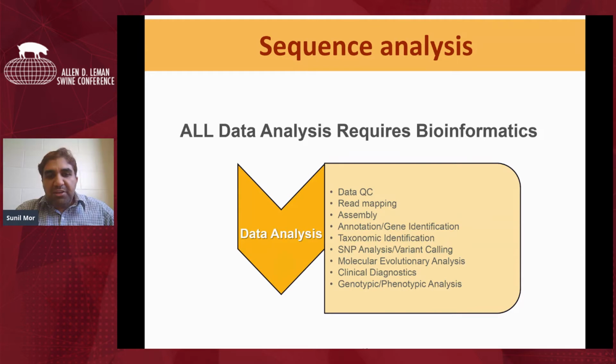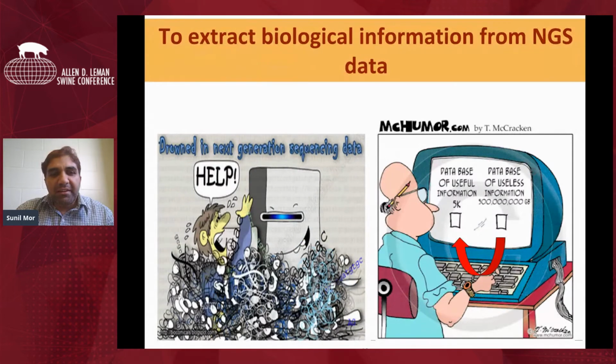Different steps are involved in the bioinformatics. Again, it's a challenge to find the most important information out of these millions or billions of reads, and this is considered the most challenging part nowadays.